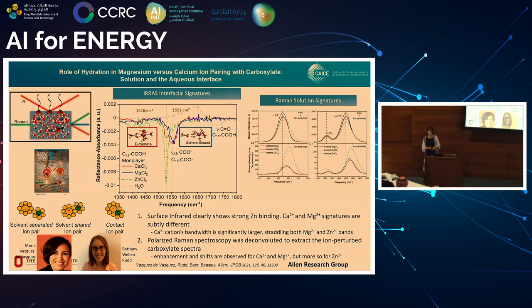There's a controversy in the literature about how magnesium is hydrated, how it actually binds to these head groups, or binds to other maybe acetates, and in the end, just to make a quick point, magnesium does stay completely hydrated to a carboxylic acid head group or carboxylate compared to calcium, even though calcium's a very strong binder, obviously, but so is magnesium.